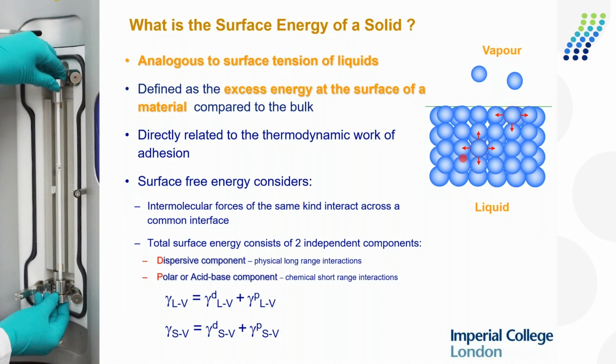So in fact, it takes a bit of energy. If I want to create some surface here, it takes a bit more energy to create that than if I was to move some molecules internally. So molecules on the surface require a bit more energy to be moved to create new surface area. And this relates to effectively the thermodynamics of adhesion. So essentially, when I'm creating new surface for a liquid or indeed for a solid, I need to pull molecules apart. So any process by which I'm going to create new surface is going to involve intermolecular forces. These are the molecular forces at work that are present between all molecules and all atoms.